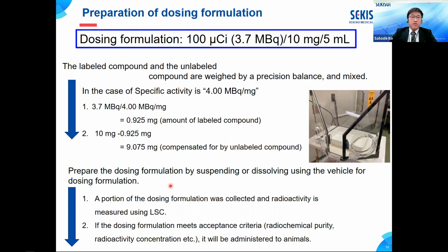Next, the dose formulation is completed by adding the prescribed amount of vehicle for preparation of the dosing formulation. After the preparation of the dosing formulation, a portion is collected and measured with a liquid scintillation counter to ensure that the dosing formulation is within the acceptance criteria.